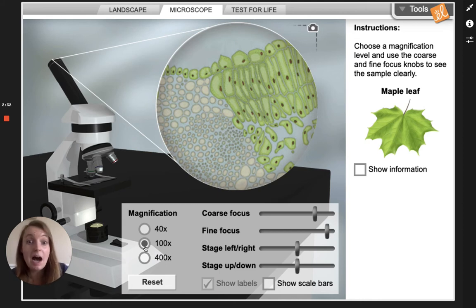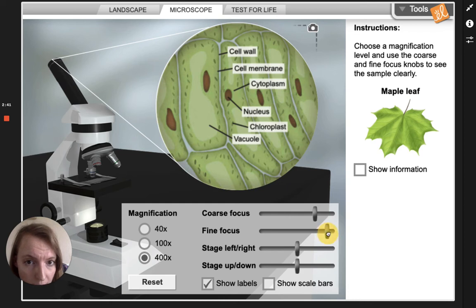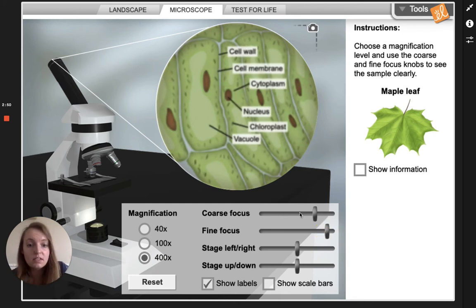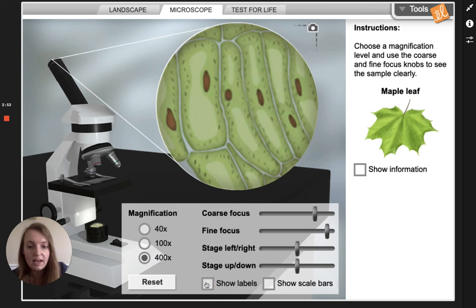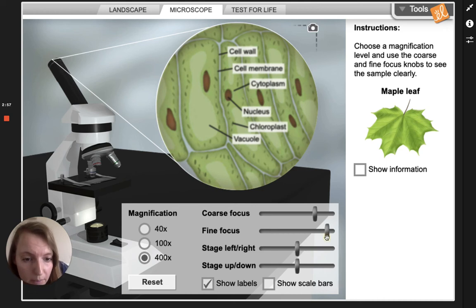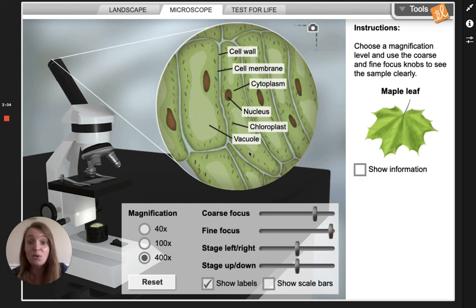Now we're gonna move up to the highest zoom, that's the 400x, and I'm only gonna use the second option — the fine focus — to try to get it as clear as possible. In Gizmo you can see that it labels the stuff for you if you click show labels. I could probably get it a little bit better in focus. There we go — it labels the stuff for you.